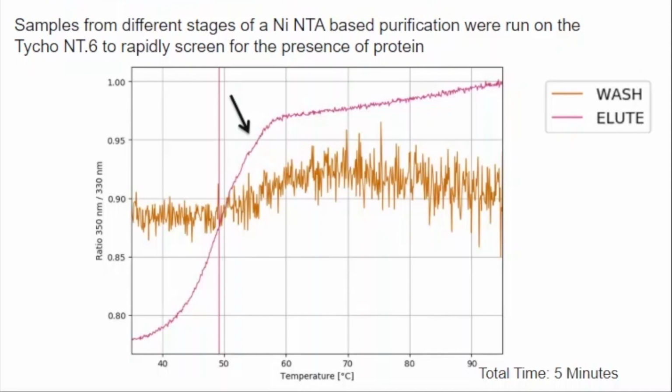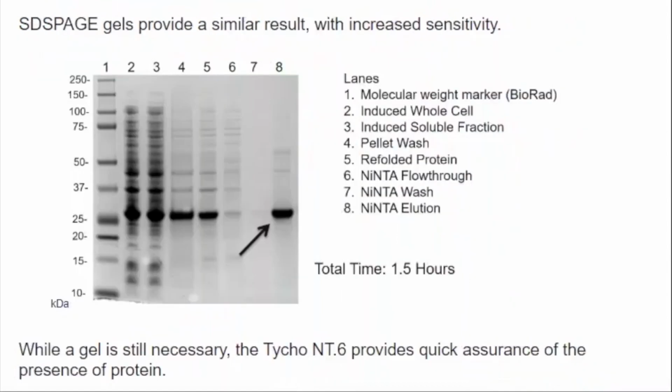But as you can imagine, all of us in protein purification, we do lots of SDS-PAGE, so we're reliant on that technique. And so how does that compare to the Tycho? I have a picture of my gel here that shows the protein purification, starting with the induced whole cell and ending with the elution fraction, with my protein of interest being slightly larger than 25 kilodaltons, as indicated by the arrow.